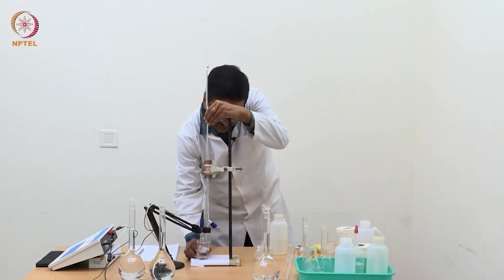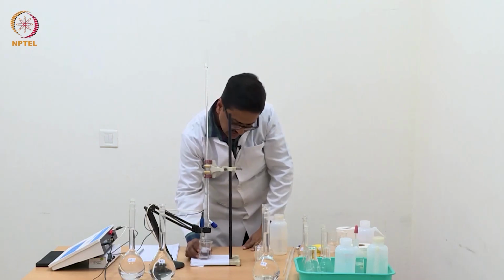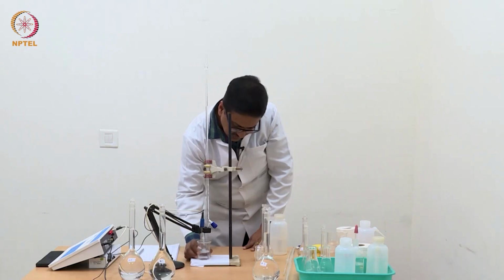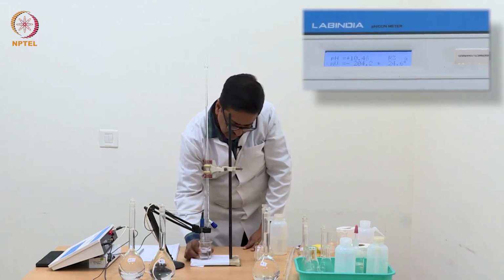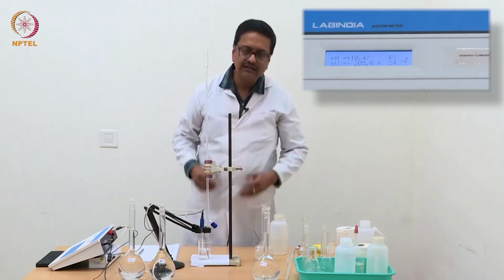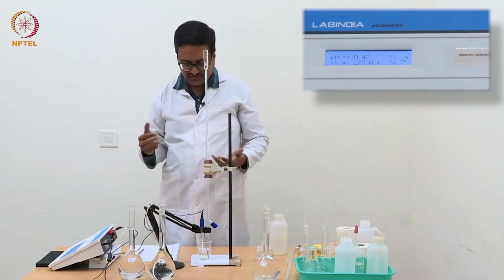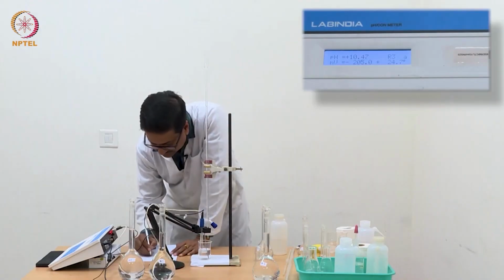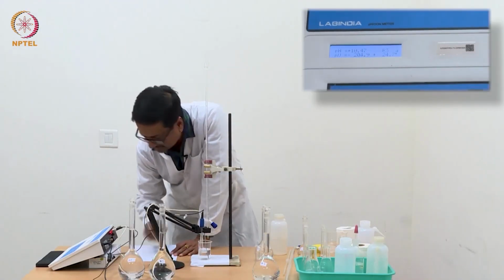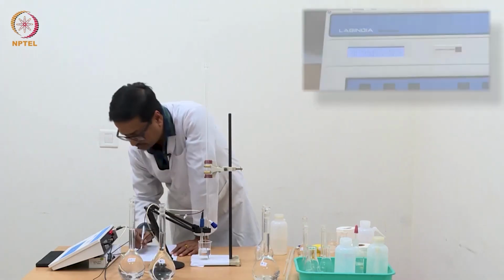Remember that after every addition of a very tiny amount of NaOH, you have to shake this solution well so that the solution becomes homogeneous. The NaOH that has been added is distributed throughout the solution and the pH that we read is the pH of this solution. So now I have reached 1.64 ml and the pH is 10.47.